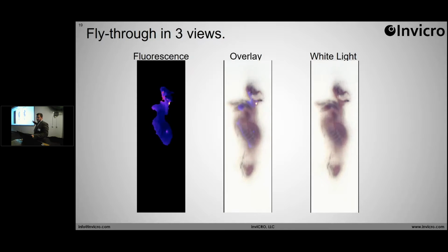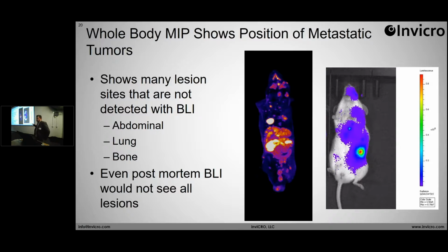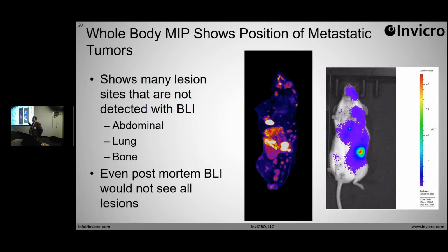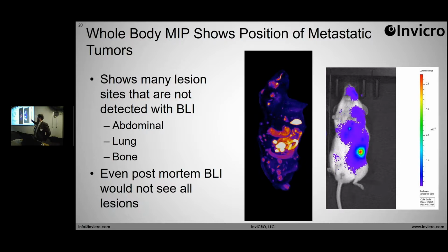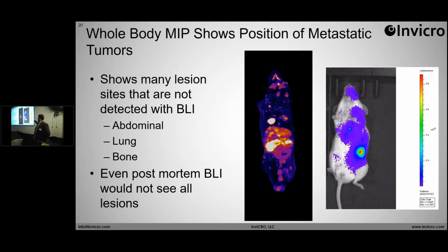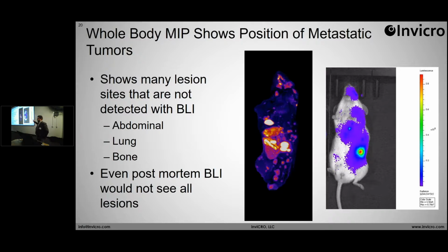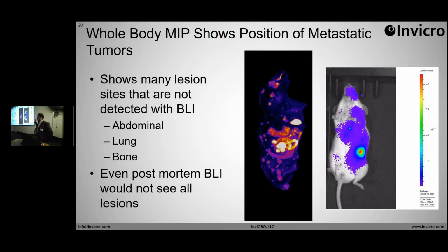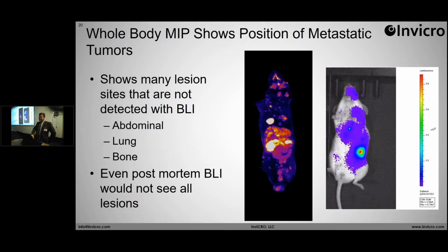This is an image of the fluorescence. But we can also compare this directly to the bioluminescence imaging. I think this was actually done on the same day. So we did the bioluminescence imaging, and then we cut the subject up. These, again, are complementary imaging assays. The bioluminescence can be done longitudinally in vivo, and we can compare it directly in VivoQuant to this high-resolution 3D fluorescence image. Even in the bioluminescence image, it's tough to see what's going on inside the subject, so sometimes nothing beats cutting it up and taking a look.